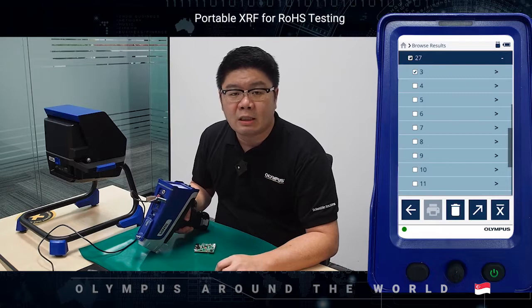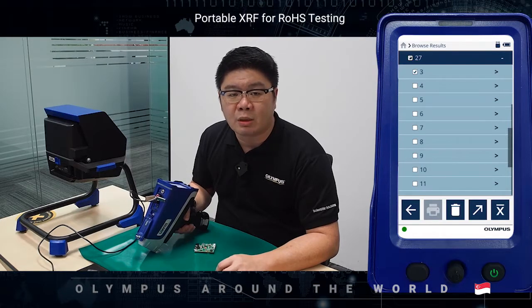With this feature, you will no longer need to connect the Vanta to a computer anymore. With our ultra-sensitive detector and highly textured X-ray tube, we are able to provide the versatility of using it as a handheld XRF or benchtop, combining the accuracy and stability of a conventional benchtop XRF system.